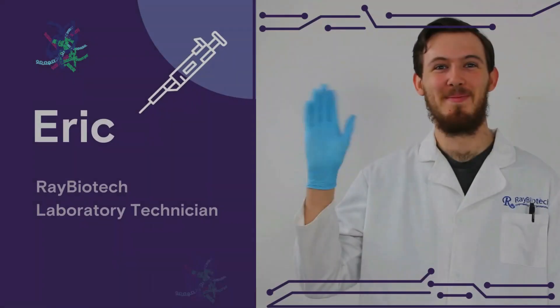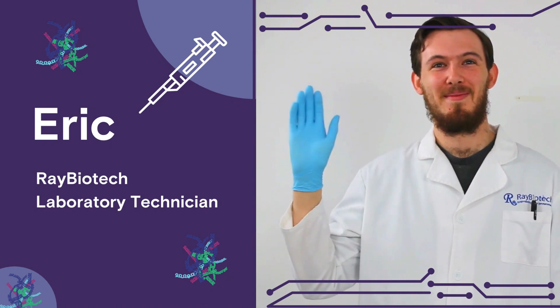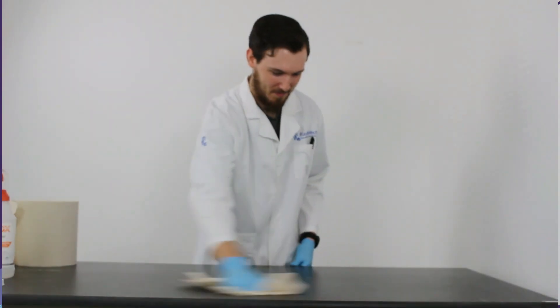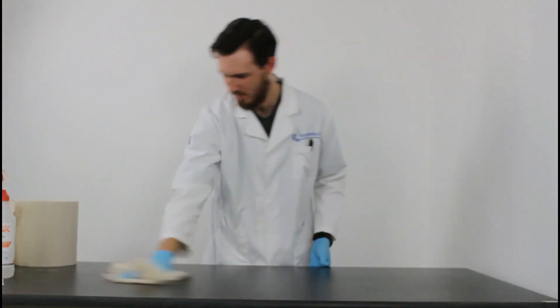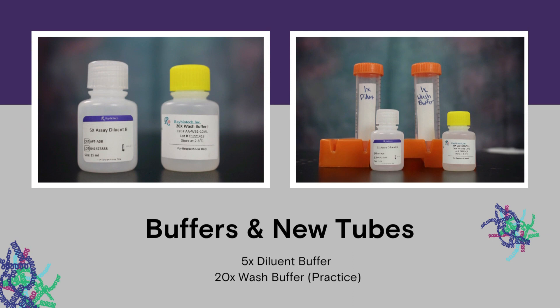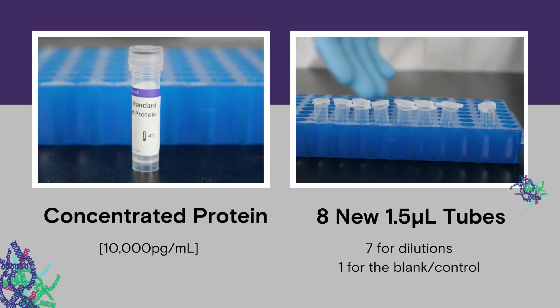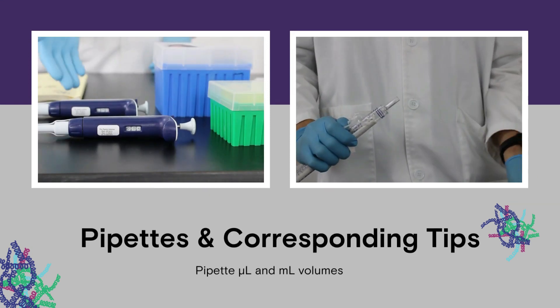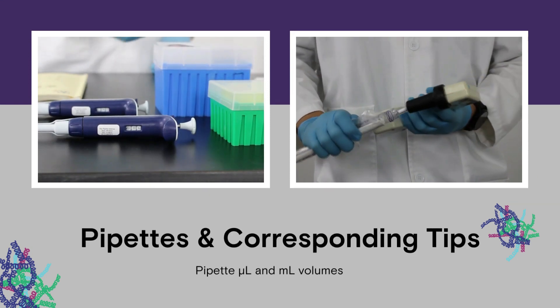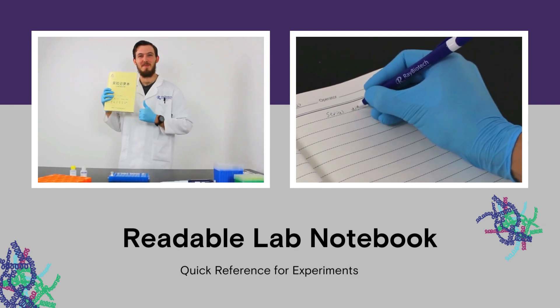All right, let's get started. Let me introduce Eric, a real-world Ray Biotech laboratory technician. He's already at work cleaning the benchtop to prevent contamination. Right now, Eric is grabbing buffers and new tubes, a concentrated protein in eight new 1.5 microliter microfuge tubes, pipettes and the corresponding pipette tips.